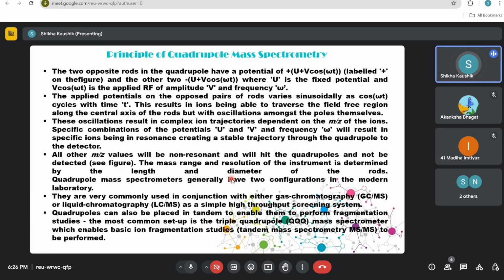So these are the things that you have to consider, because proteomics mass spectroscopy also has its limitations. If the ions are not formed, if they have not experienced any kind of resonance, they will not reach the detector, and we will never be able to catch those ions.